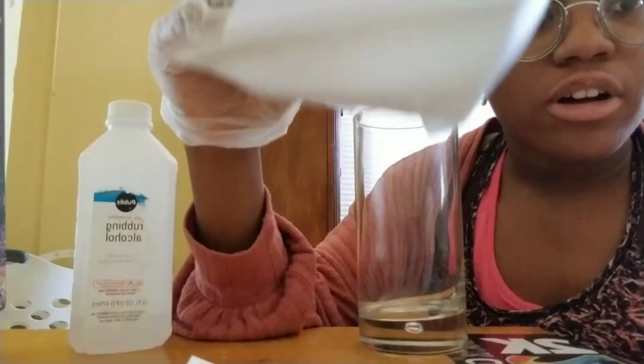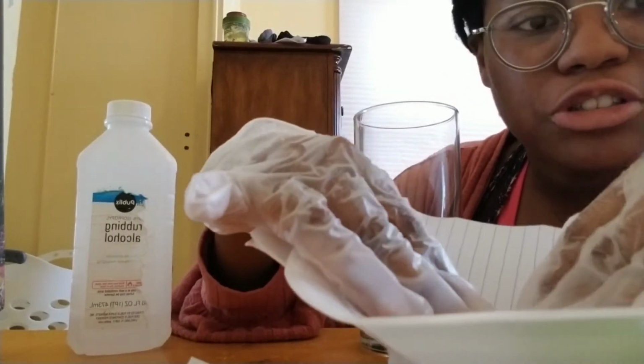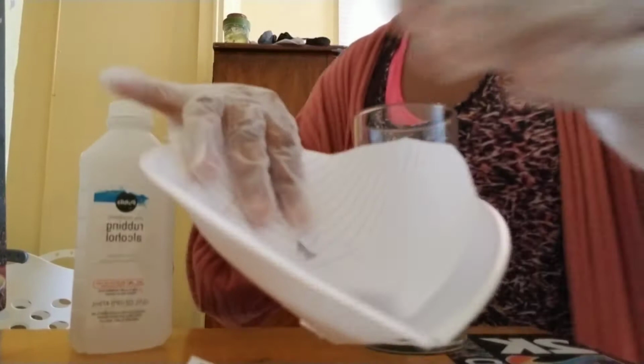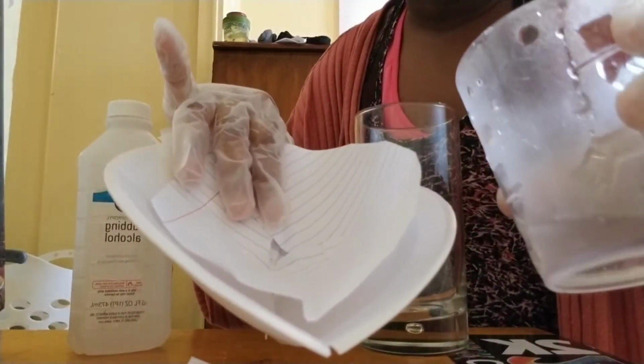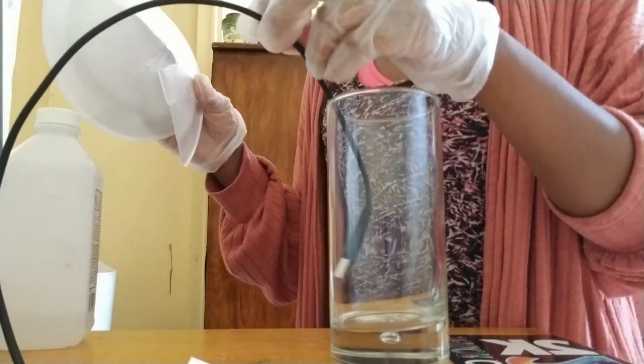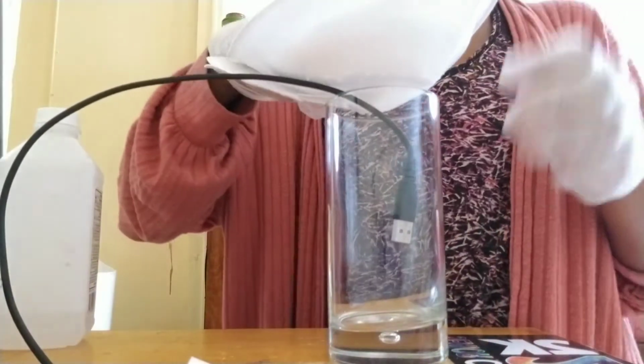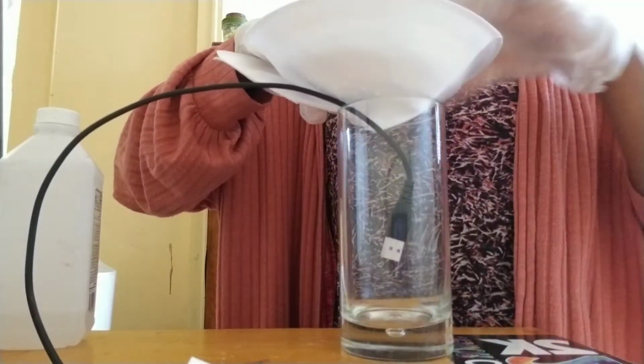First, we're going to measure the mass of the filter paper, and then we're going to pre-moisten it with our ethanol solution. Alright, this is our filter that I put on top of our Buchner funnel. And then we're going to prep it with our 50% ethanol, 50% water solution. Okay, after it's pre-moistened, my charger is representing my vacuum hose, and the Buchner funnel is sitting right on top of it.